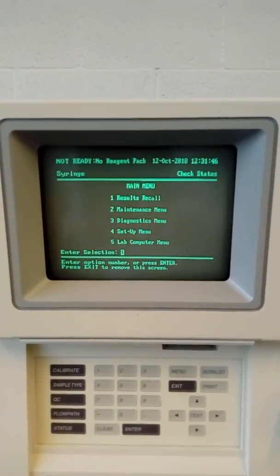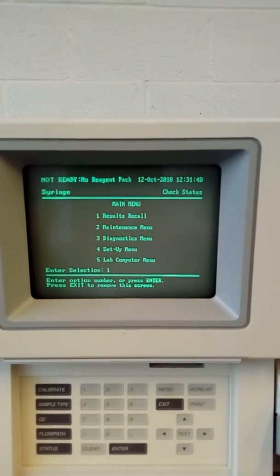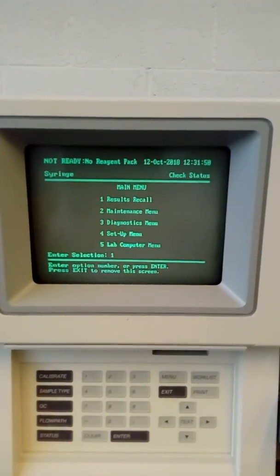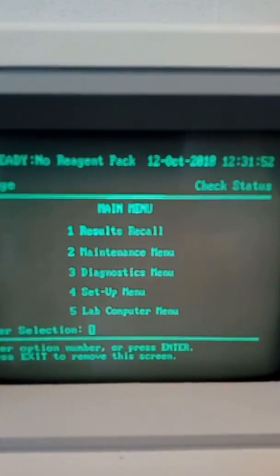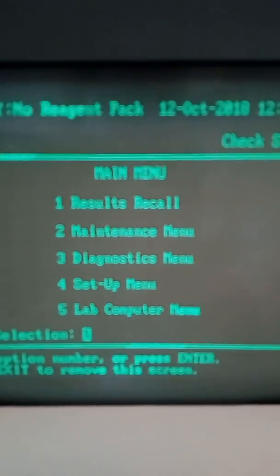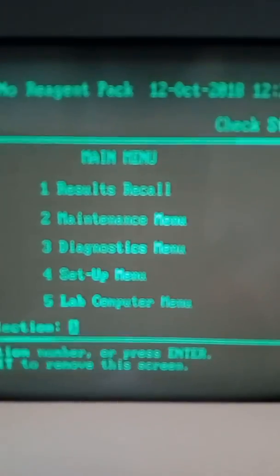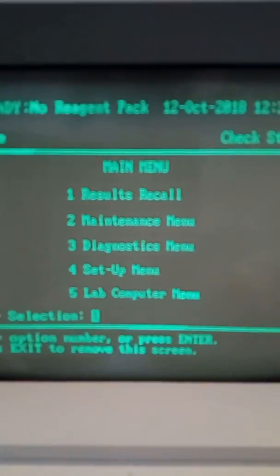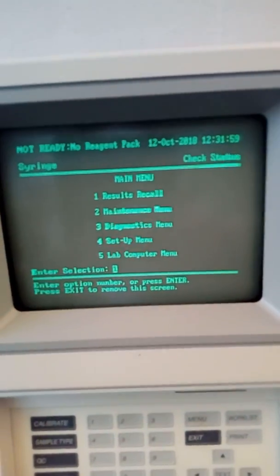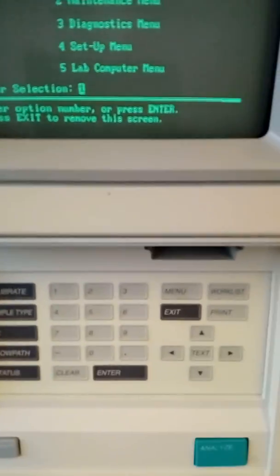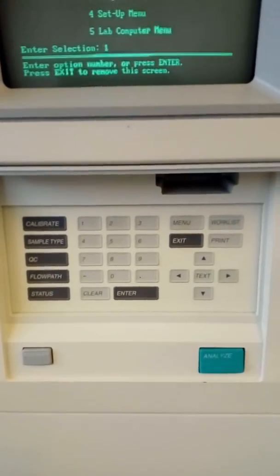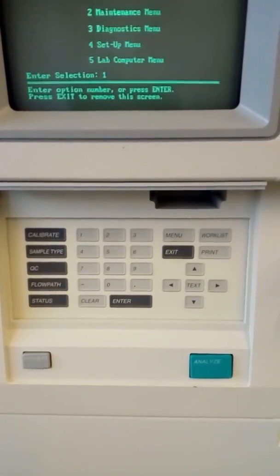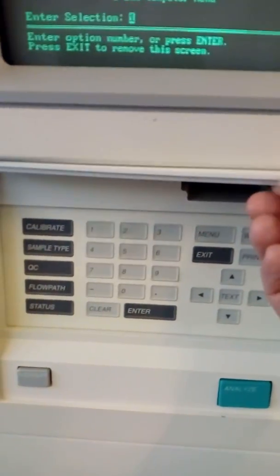As you can see on the screen, it's at the main menu. This is the keypad of the equipment, which is a cover.